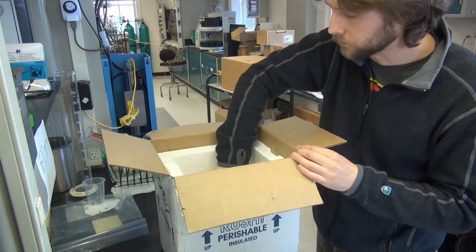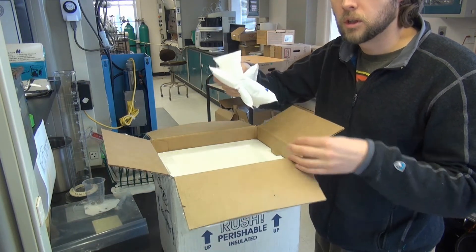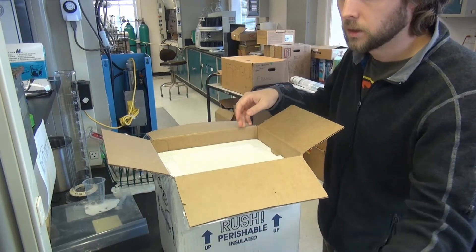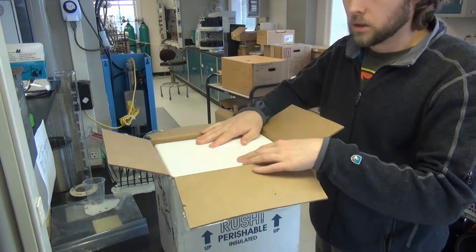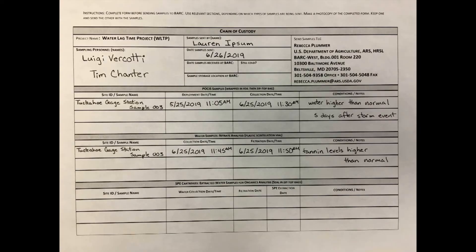Don't forget the water sample. The contents of the cooler must be secure; add extra packing material to ensure the disk will not rattle in transit. Close the Styrofoam cooler and include a copy of the chain of custody form. Remember to fill out the top with the packer's name and shipping date.